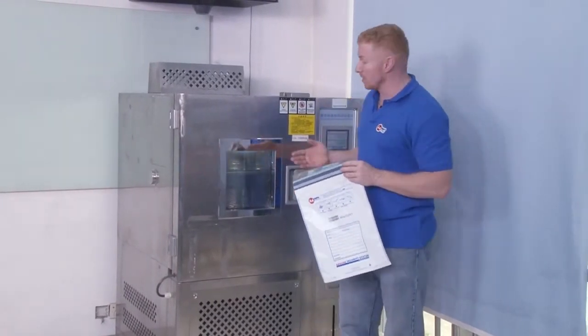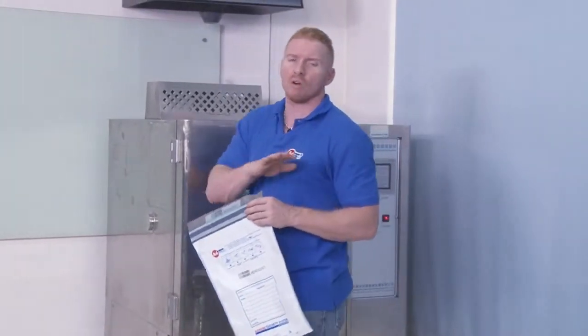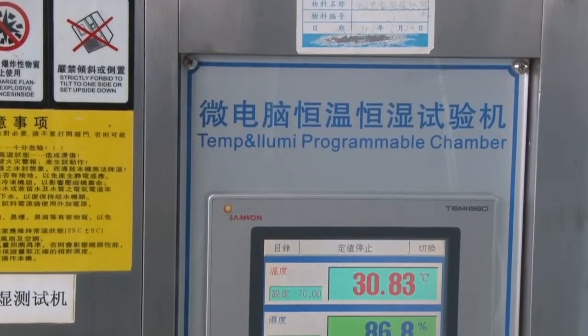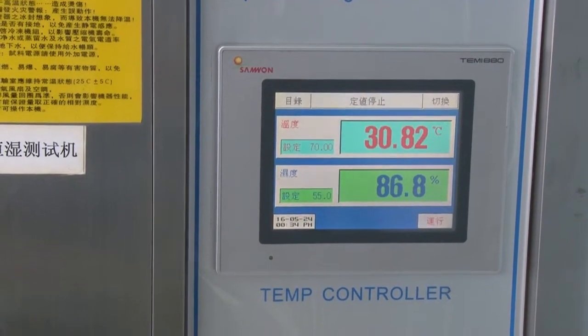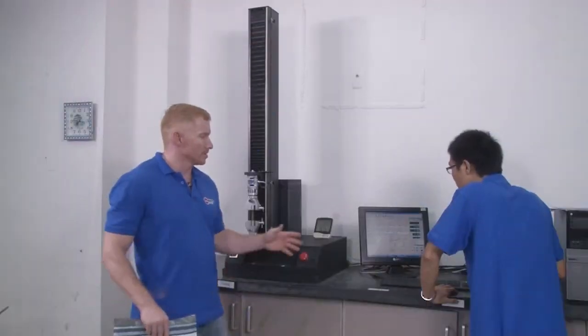For over a month they go across the equator twice. We need to have an easy process to test our products in the container so customers receive them in good condition. We can also use it for testing the valid time of our security seal. This is a very important machine for the physical and tensile property test.